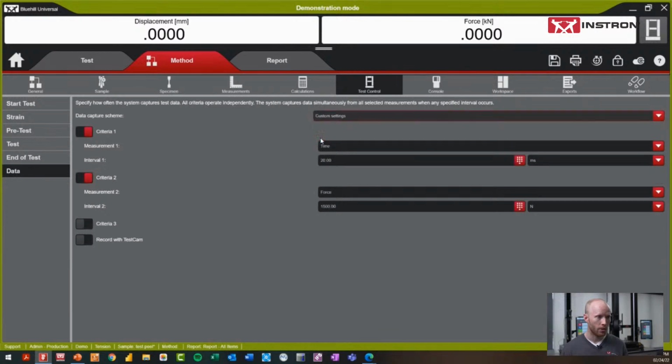So if we do need to deviate from those default values because of what you're seeing in your curve and maybe some questionable results, maybe they're not actually calculating, or maybe you're questioning them, you can come in and edit these to be whatever you desire.